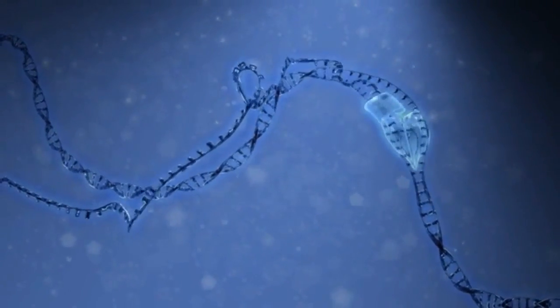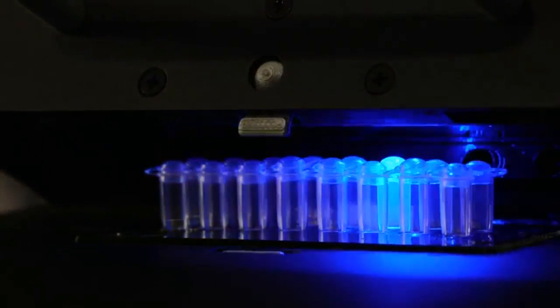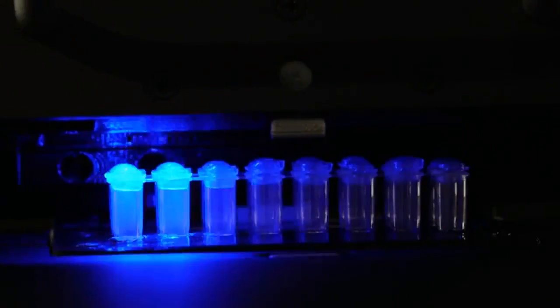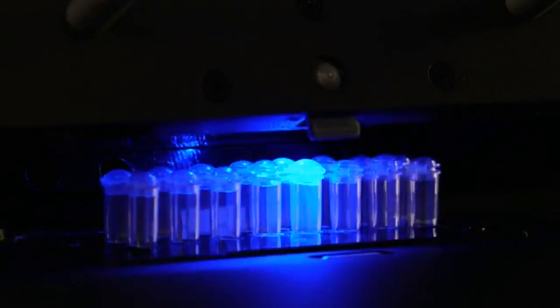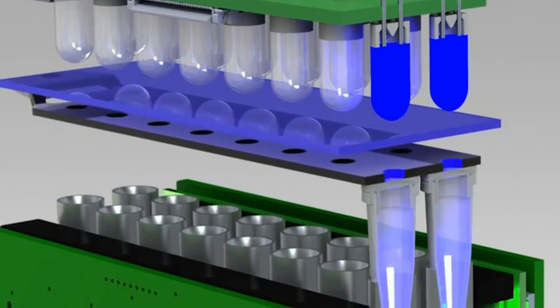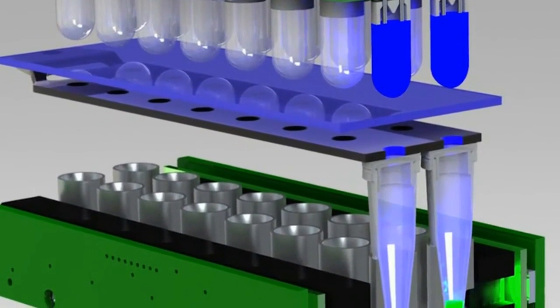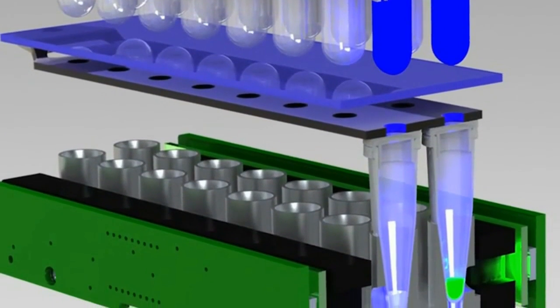You can imagine in this exponential growth process, one, two, three, four molecules, we can't really see the difference yet. But as soon as the exponential curve takes off, we can see them. We shine blue light at the sample, and if DNA is present, another molecule within the sample converts this blue light to green light. The green light then passes through an optical filter and hits a photo detector, allowing us to measure the amount of DNA present.